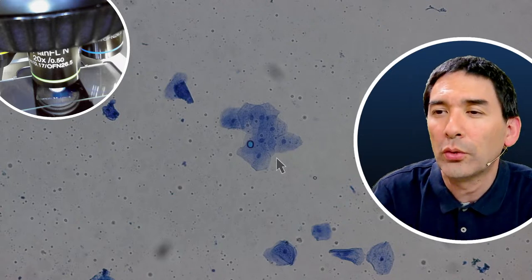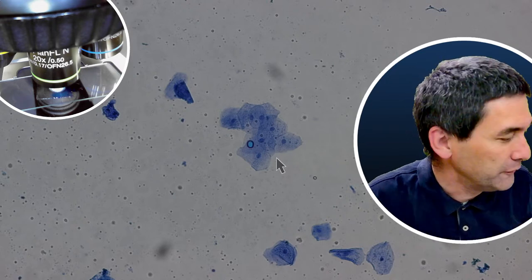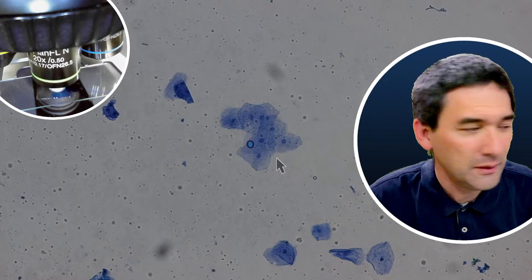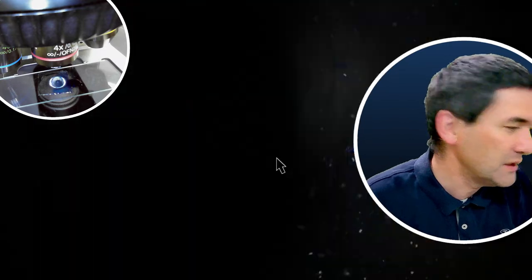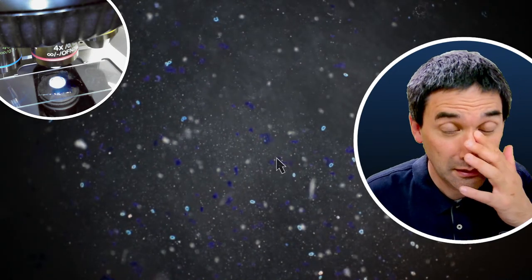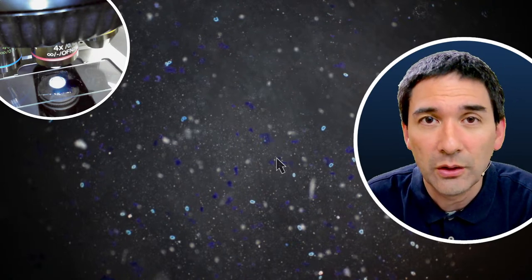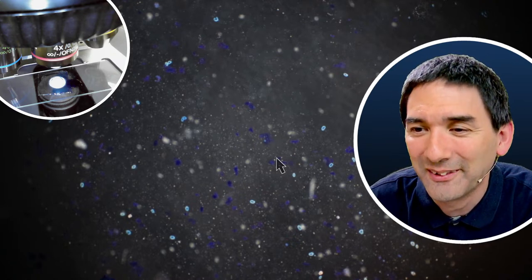Can you do dark field or oblique on the epithelial cells? It's another question. Unfortunately, yes, I can do dark field, but only with my 4x objective, and that is the problem that I have. So this basically means that you're not able to see a lot. This is now dark field using the 4x objective. You see that the blue dots over there are of course the epithelial cells, and all of the white spots that you see are dust and dirt. So my microscope's not equipped otherwise.